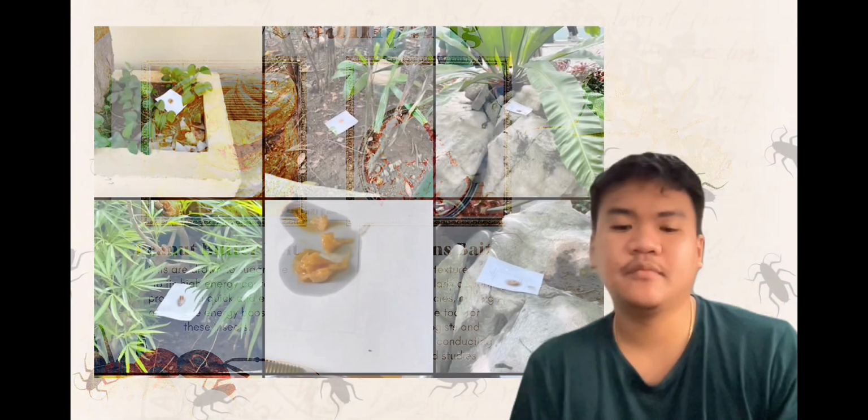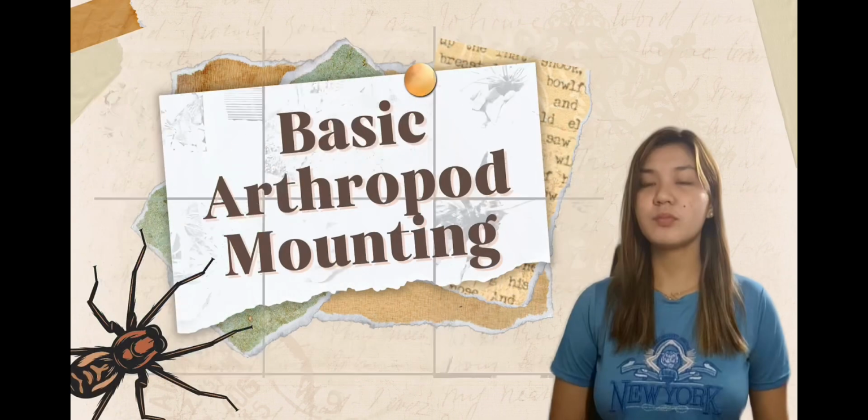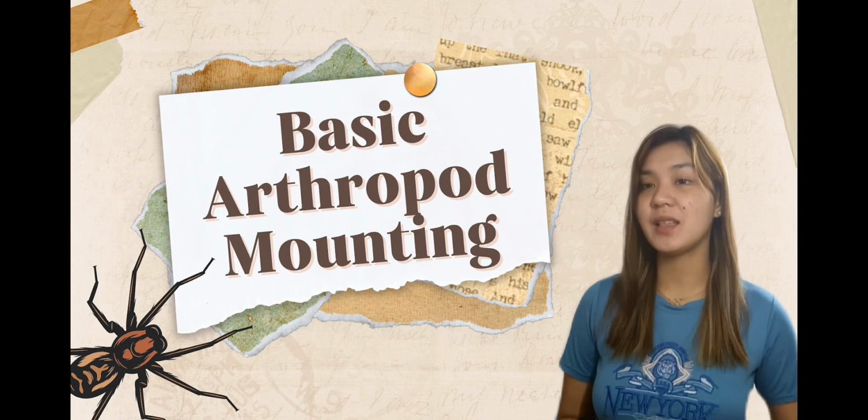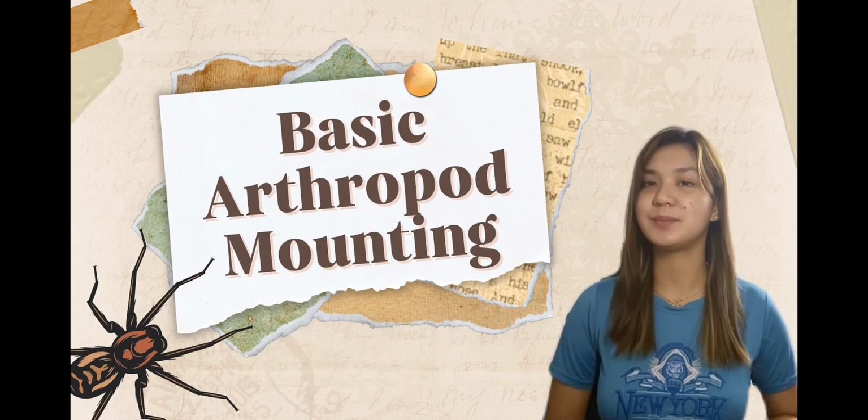These are the actual images in passive sampling. With your collection in hand, it's time to move on to the next step, the basic arthropod mounting.